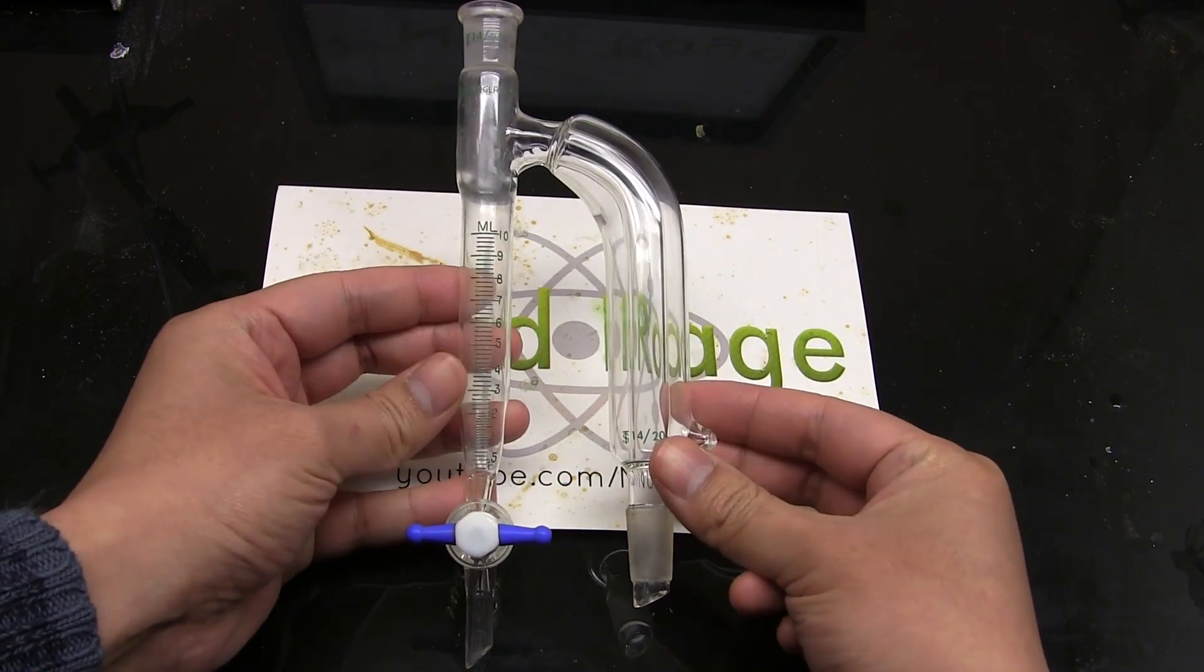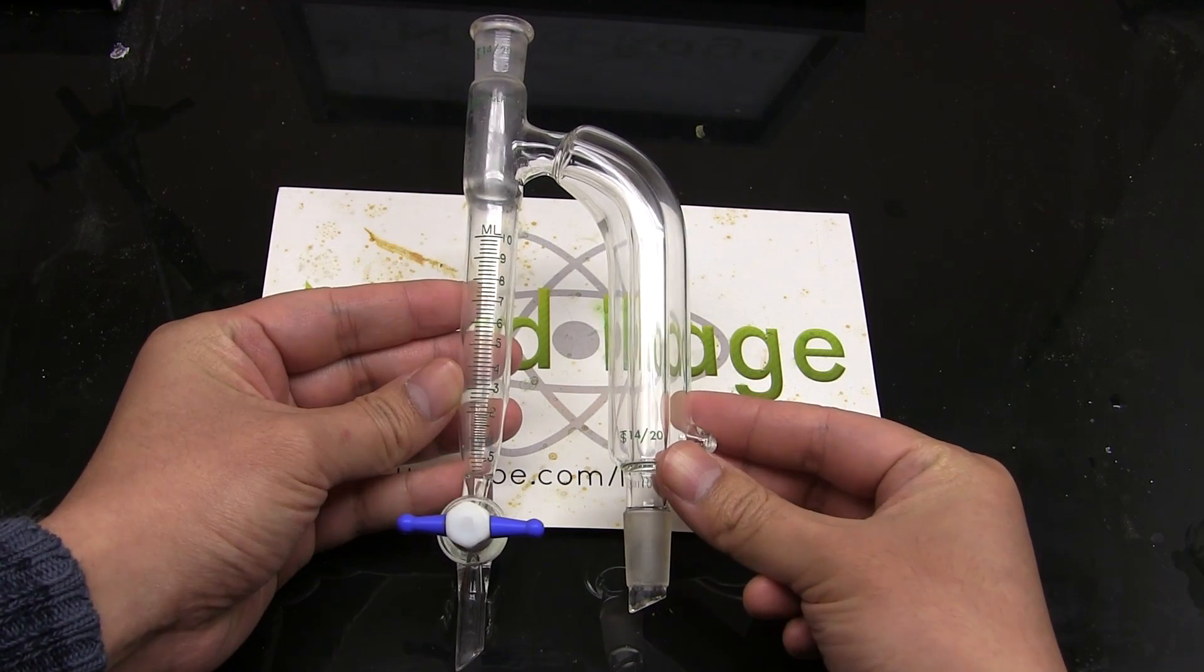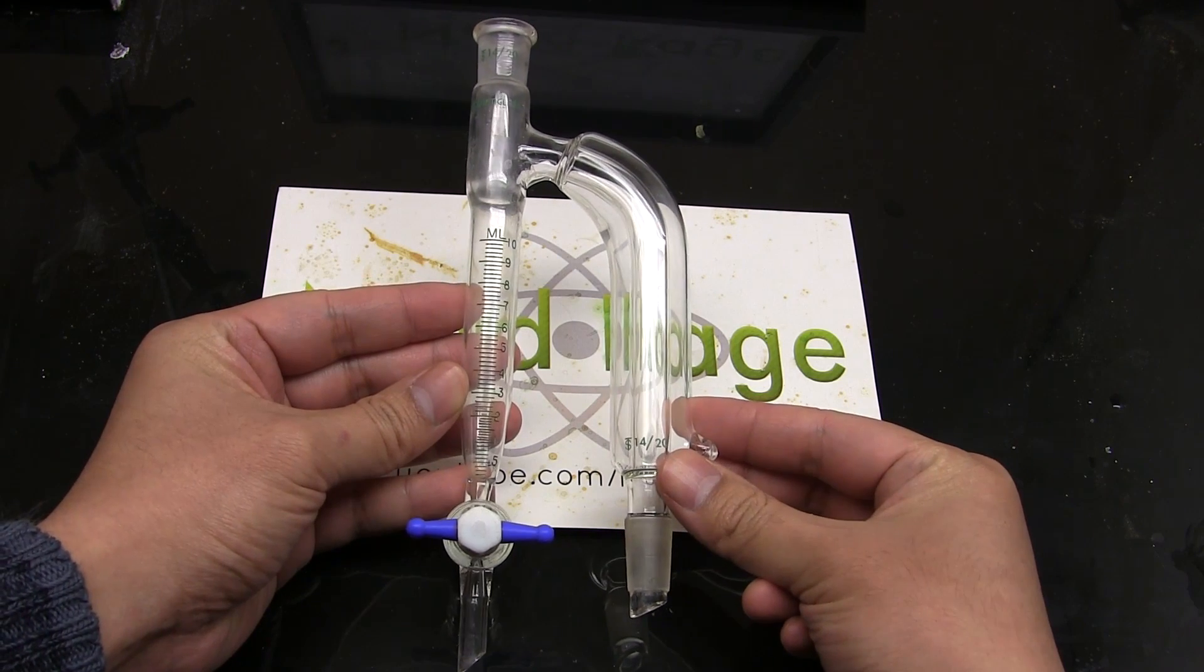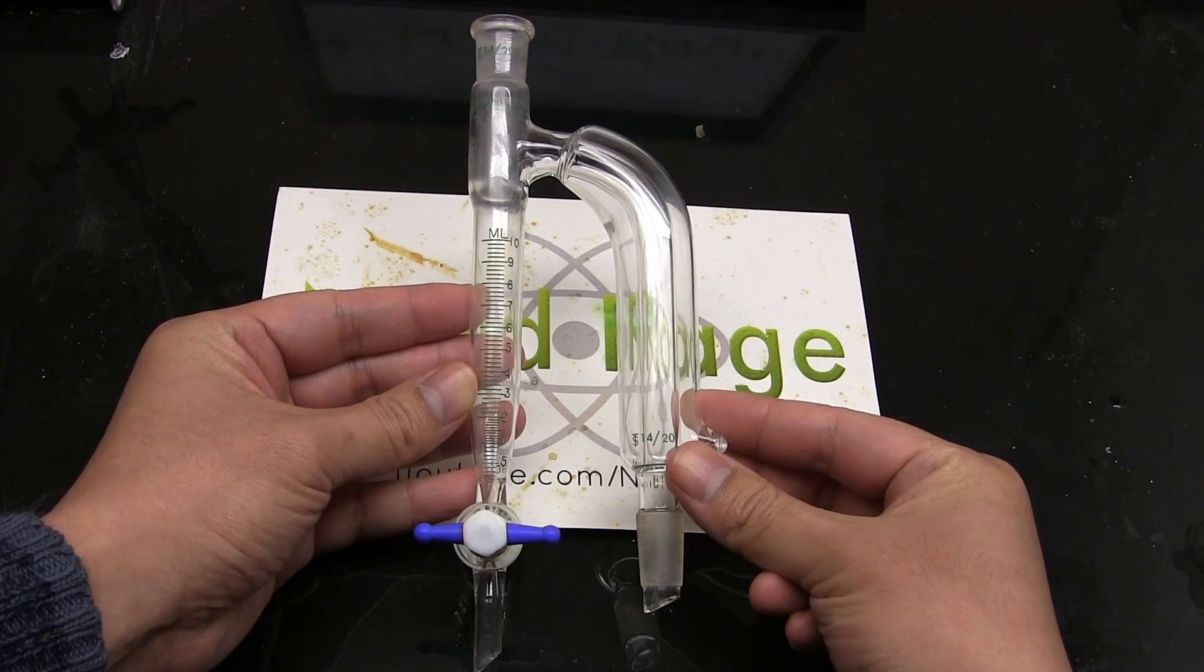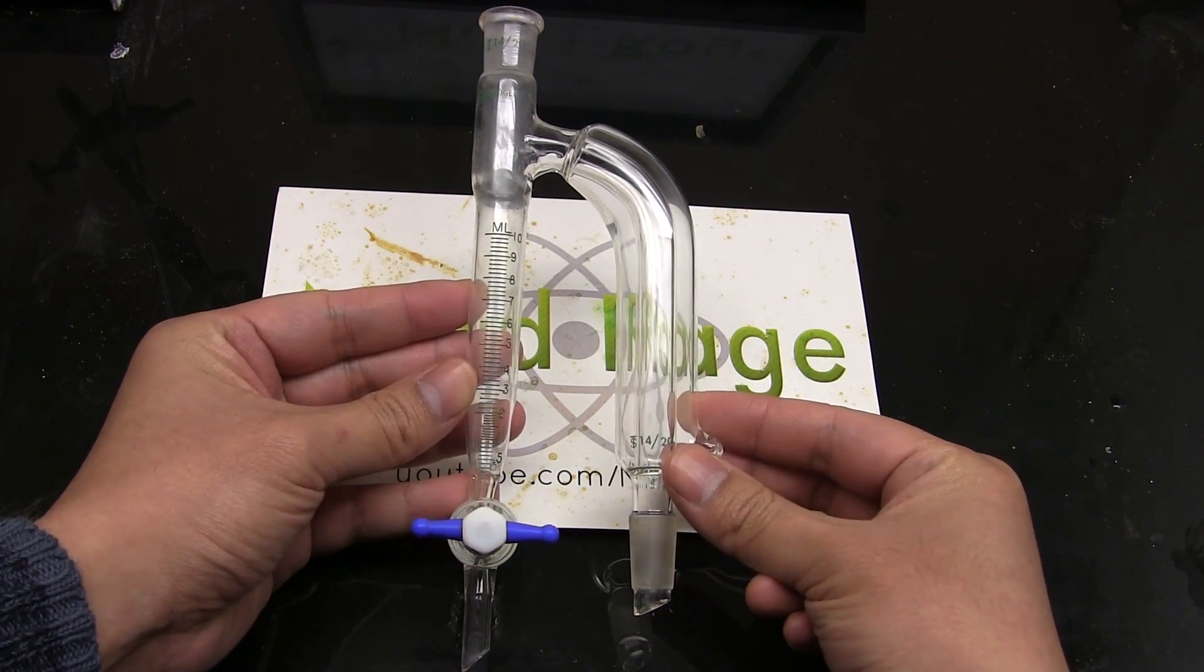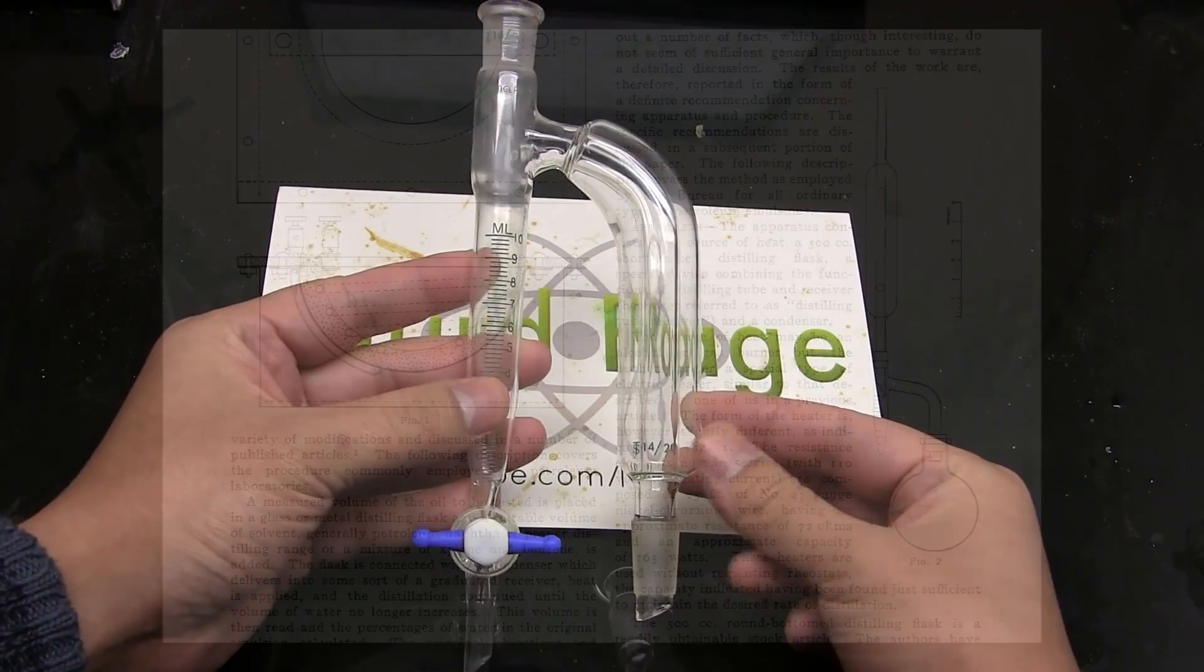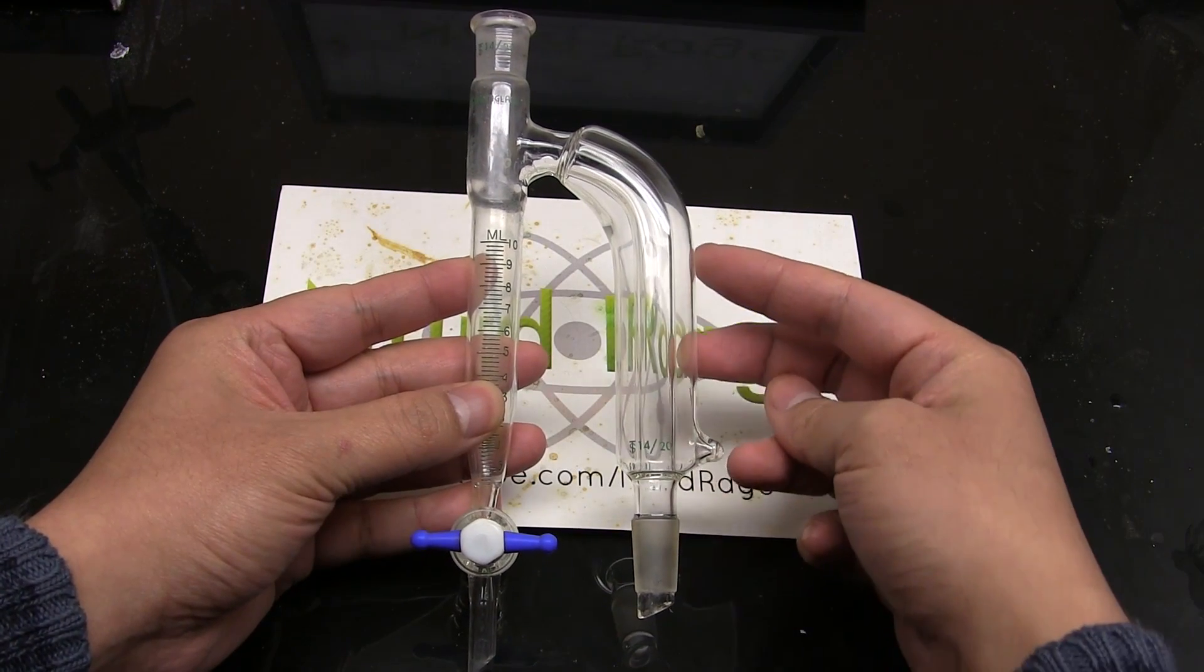Other devices under different names that essentially do the same thing include the Dean-Stark receiver, the Barrett trap and the Clevenger trap. What I have in my hand here is technically a Barrett trap because it has a stopcock for draining the water out as it accumulates. The original Dean-Stark trap has just a blind tube for measuring the water accumulated. But the name Dean-Stark trap has become so commonplace with these devices that I'm going to call it a Dean-Stark trap as well for this video.